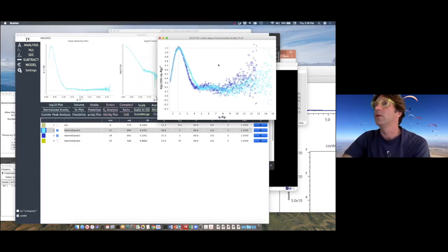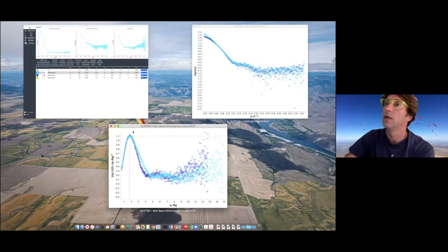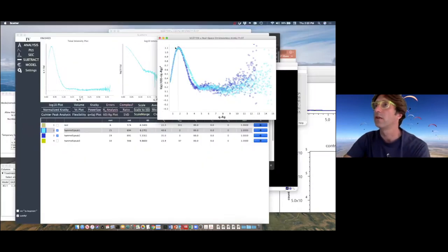Obviously, what is something bigger, smaller, sorry, and it seems like the larger particle is very transient and has some problem, as discussed. But Kratky showed that it's folded. There's not much to say about unfolding.